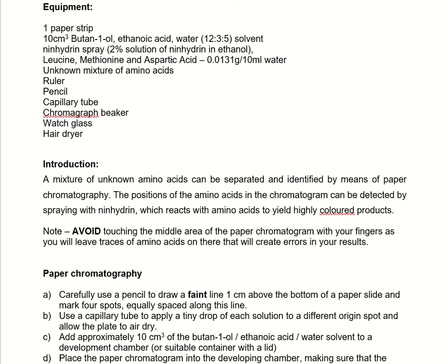Hi and welcome to this video for the BTEC Applied Science Level 3. It's Unit 2, Assignment 3 that we'll be looking at today. So this is paper chromatography.